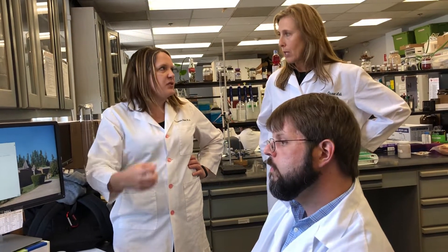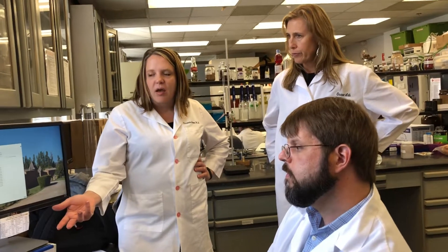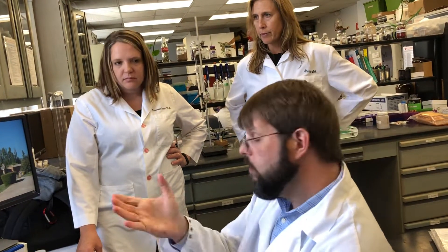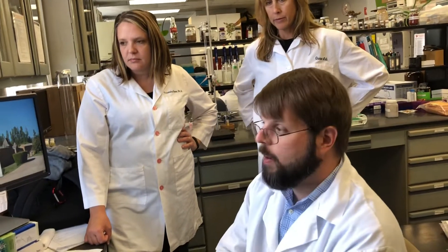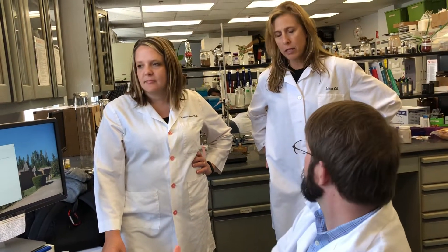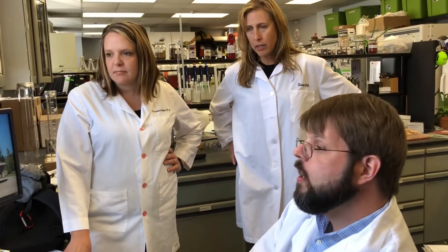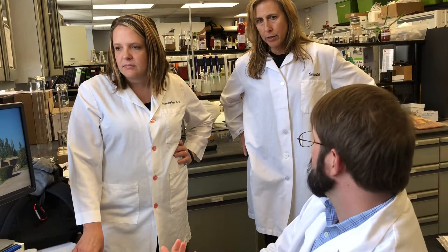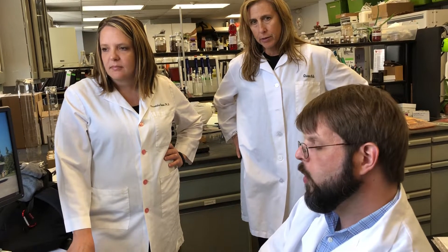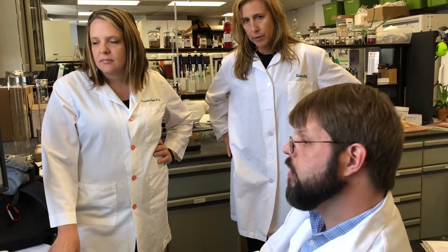It's kind of a deductive process. Once we have them at this stage, we know hopefully that they're one compound. However, we don't actually know what the identity of the compound is. So the next step is to figure out what it is — assuming it has some activity we want to explore. We'll take this to a mass spec, which will give us the molecular weight of that particular species or moiety. Then we'll also do NMR analysis — one and two dimensions — to understand its structure.